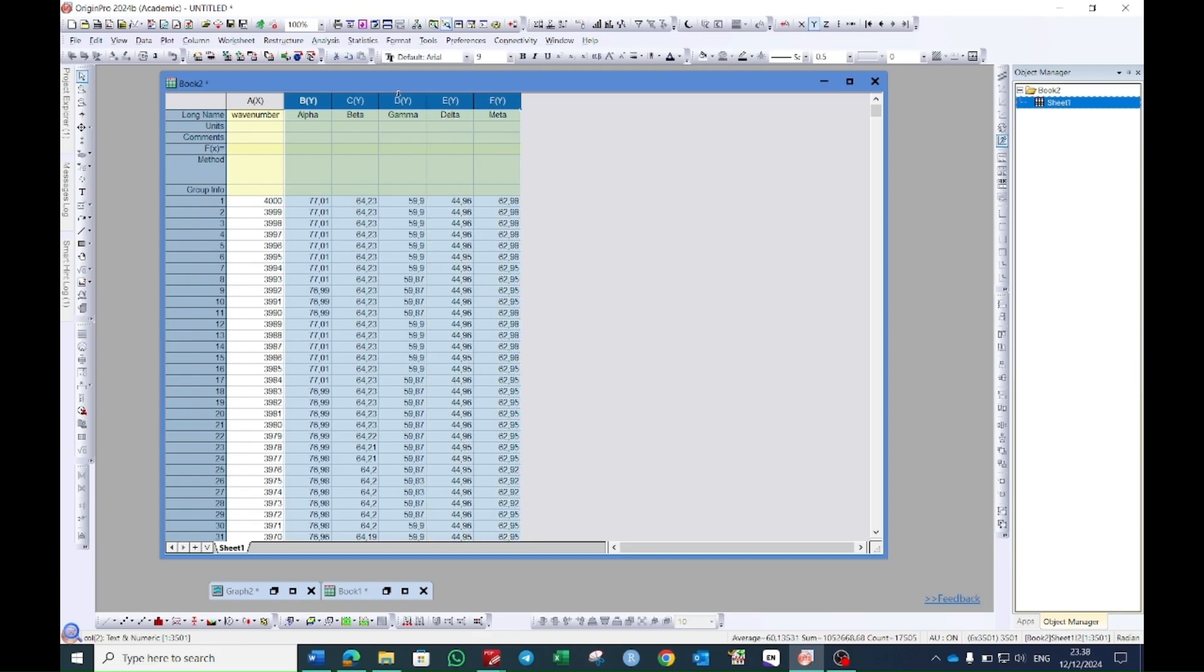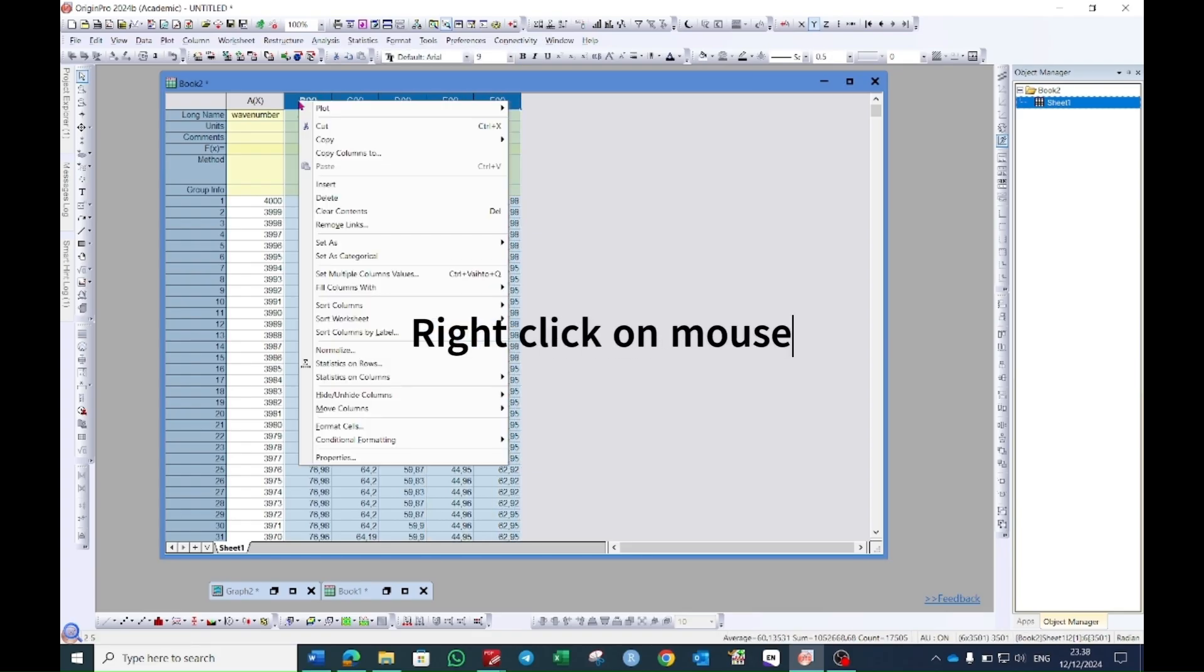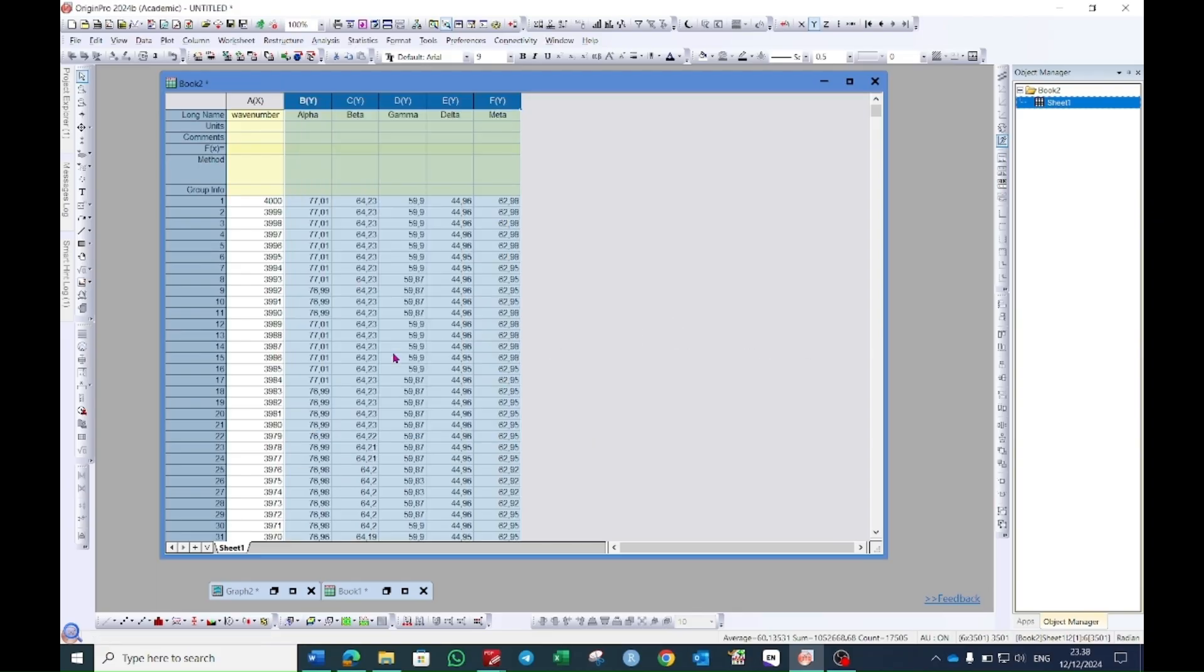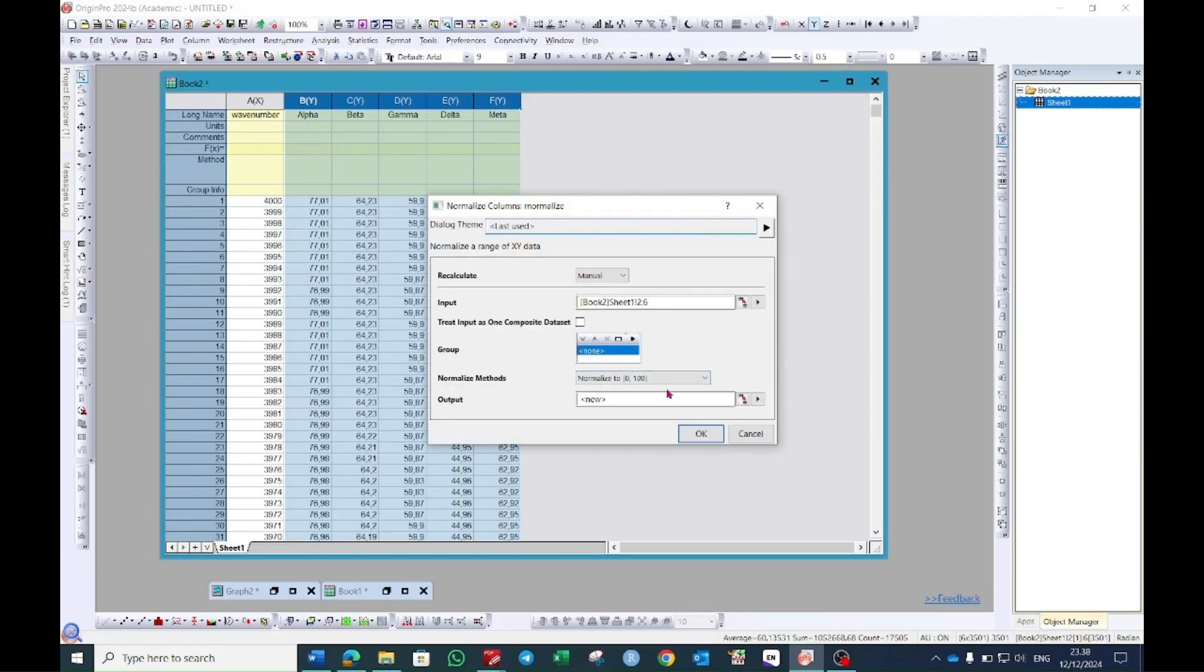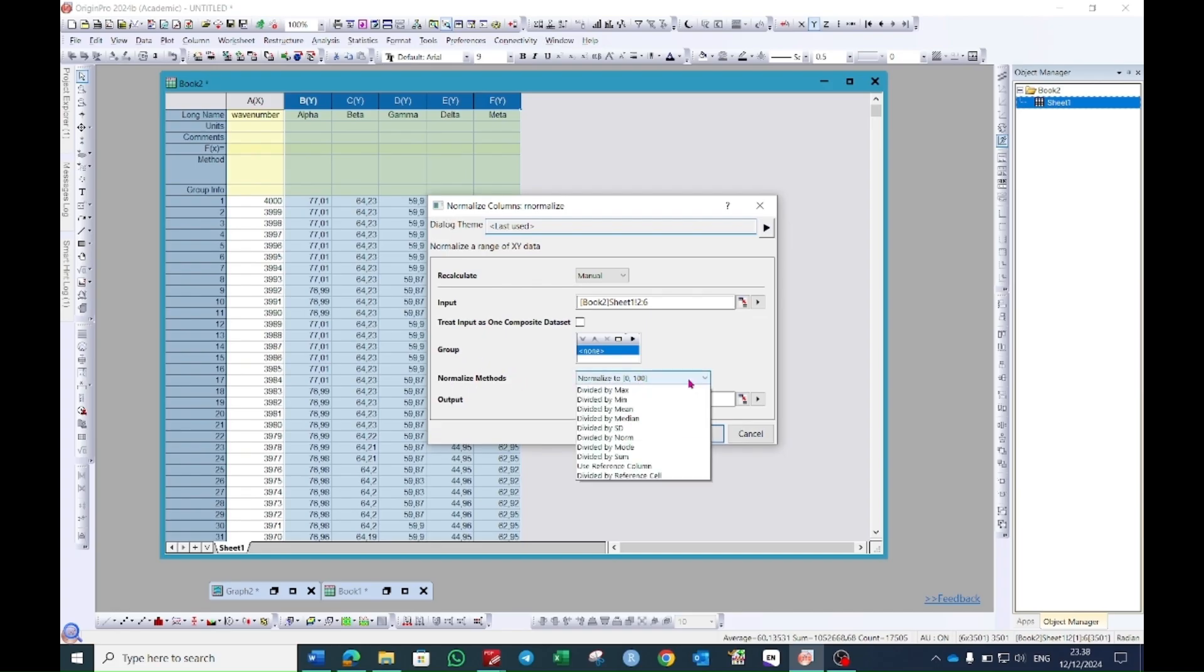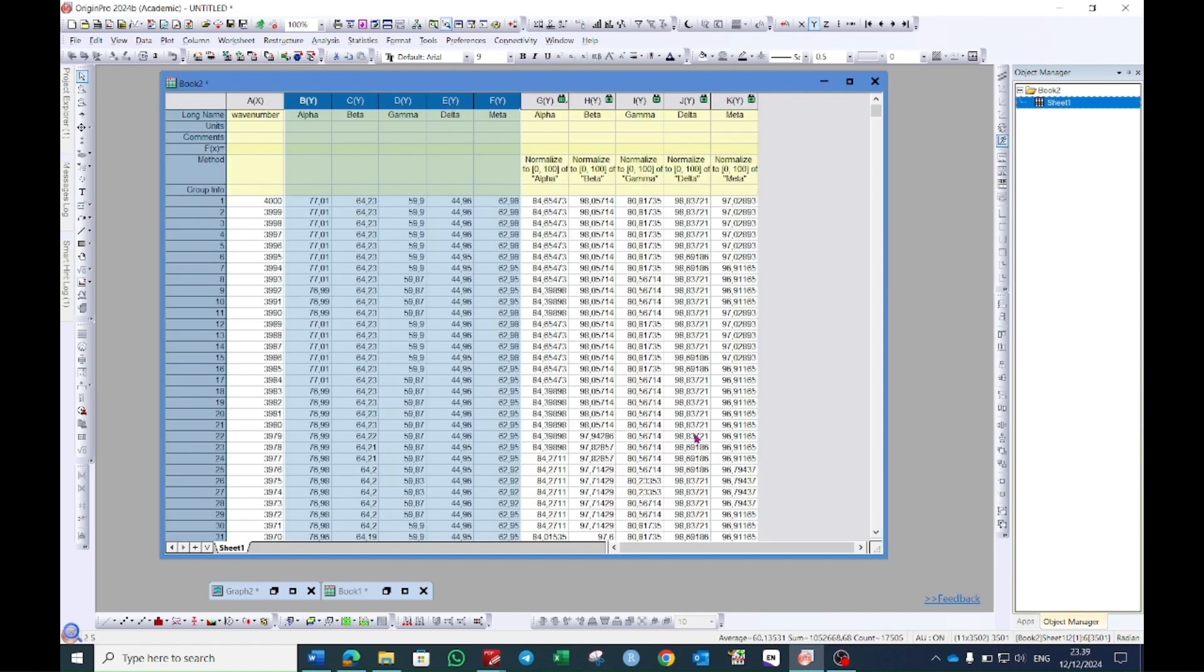So I will select all of these transmittance values of the samples. Right click on the mouse. Here you will see an option which is normalized. By selecting this a window will pop up. Here you will see a normalized method which is from 0 to 100. You can choose different but professionally mostly people use 0 to 100 and make sure that the output is new and then click OK.